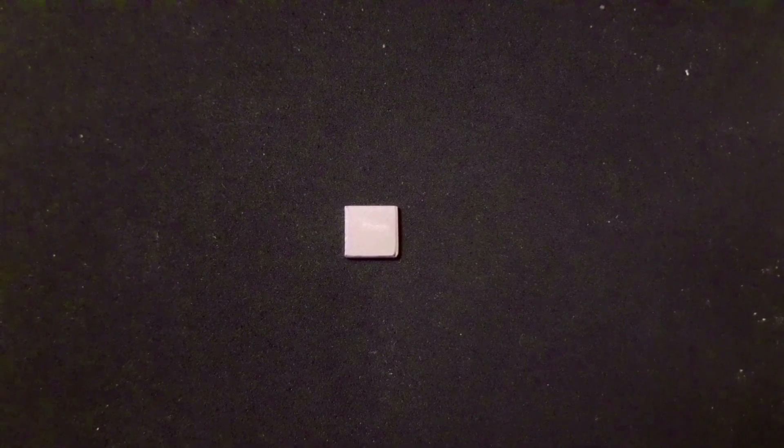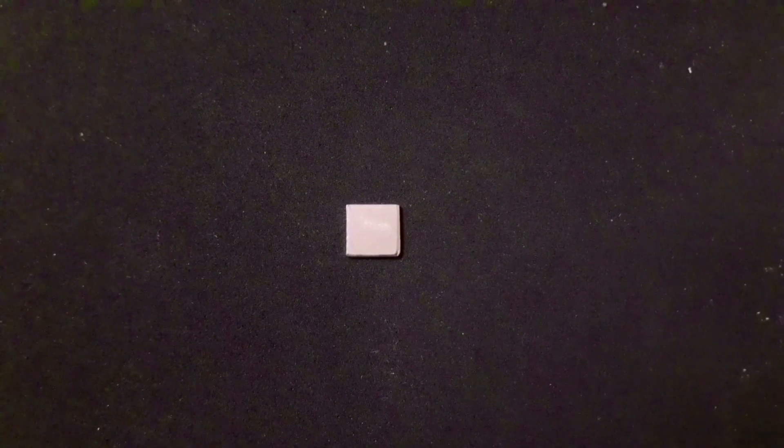This is platinum metal. As you can see it's still very white, therefore it is very passivated. Obviously, this means it would not work as a catalyst, or at best would work very poorly.